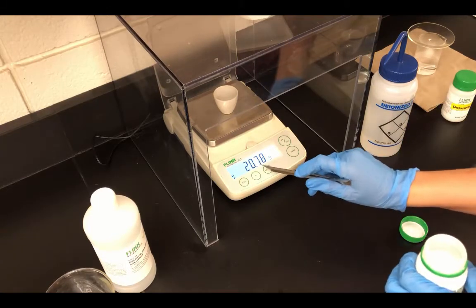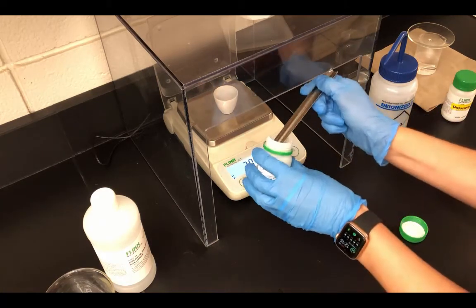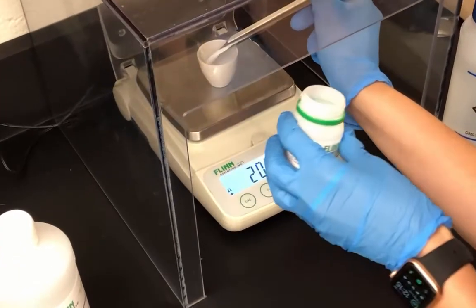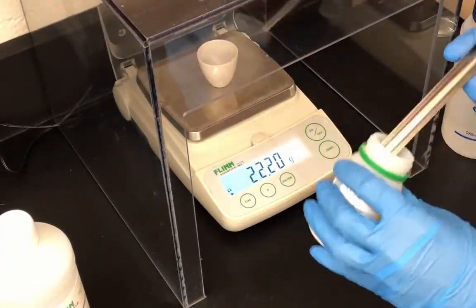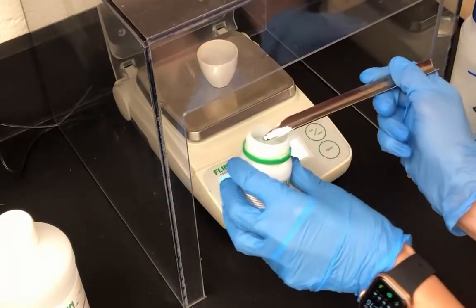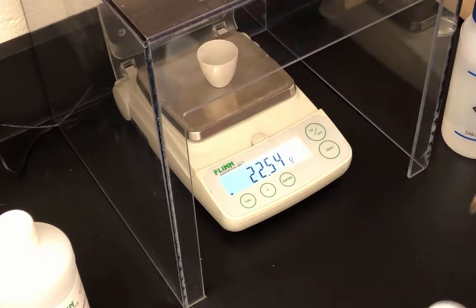So I want to add 2 grams. I want to get as close to 22.78 grams as I can, and you want to be very careful. You want to be as close to 2 grams as you can because you want this metal carbonate to be the limiting reactant.